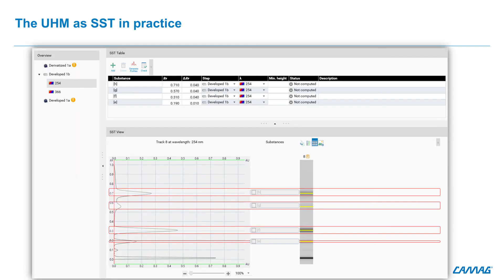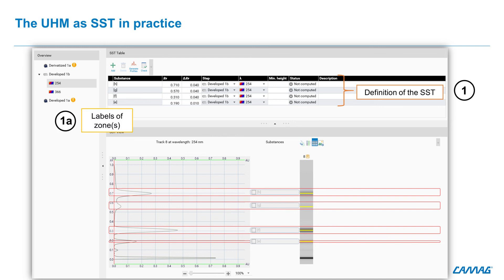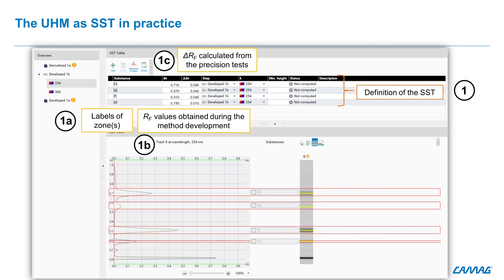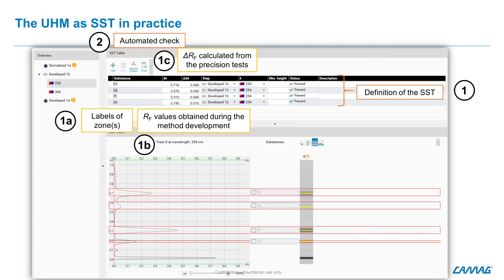How to use the UHM as SST in VisionCats: in the SST tab, the first step is to define the SST and label the zones. Then select the detection mode and fill the table with the RF values and delta obtained during the method development. When the parameters are defined, select automatic check and the software will then detect if zones are present in the specified range.